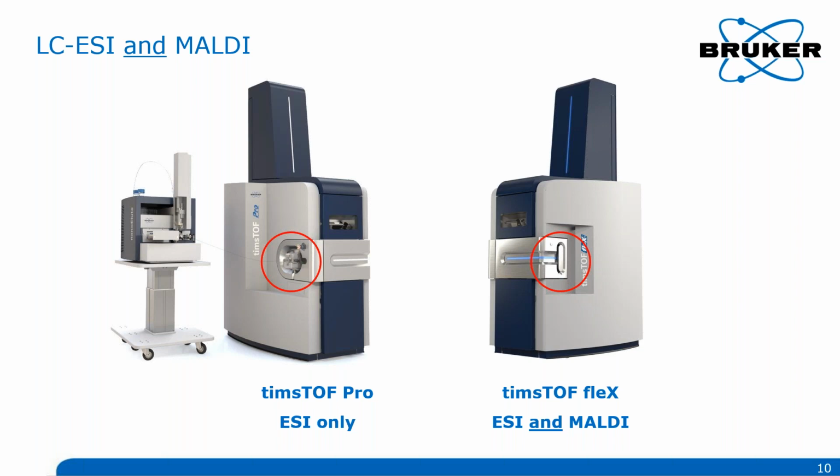In 2019, Bruker introduced a new version of this platform called timsTOF fleX, and you can see it on the right-hand side. It looks very similar, really, but there is a serious difference. timsTOF fleX brings MALDI capabilities, including surface imaging, by the way, in addition to conventional LC-ESI and GC-APCI. So no longer do you need separate instruments for LC, GC, and MALDI workflows. This multi-tool can basically do it all.